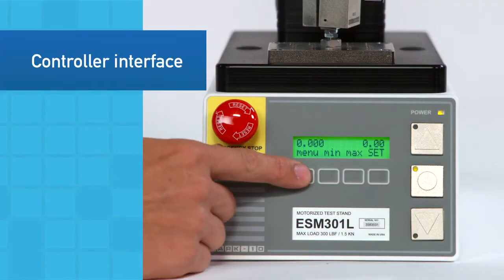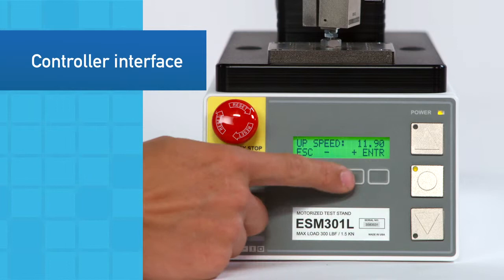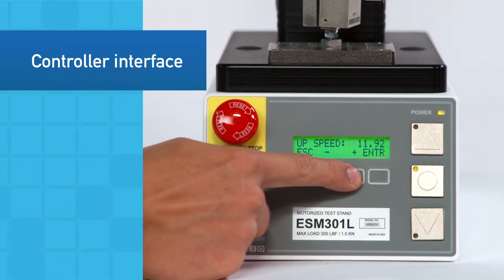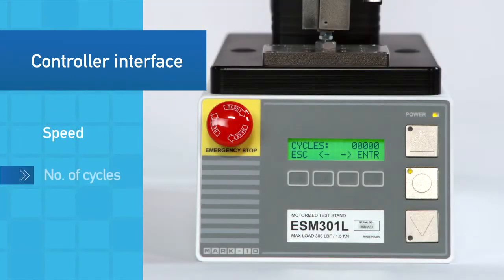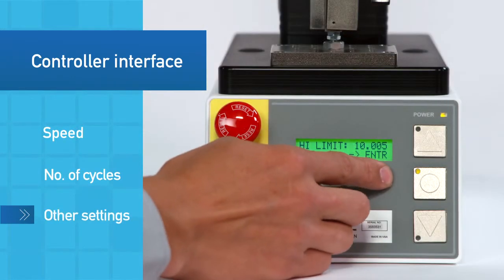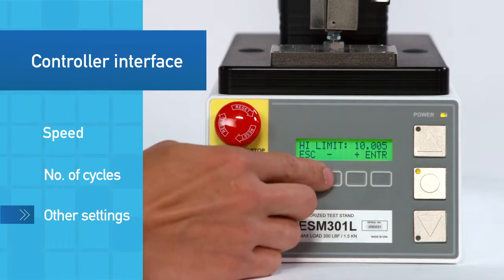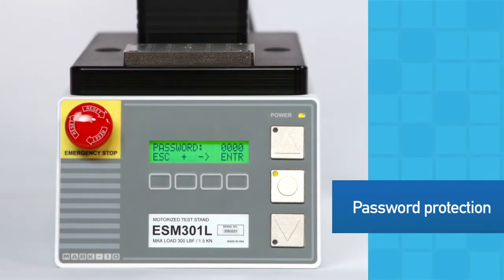Utilizing the simple controller interface, set up test parameters such as speed, number of cycles, and other settings. Password protect the menu to prevent unauthorized changes.